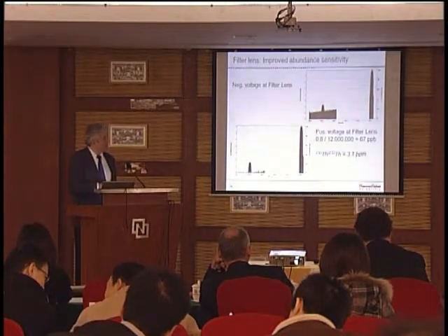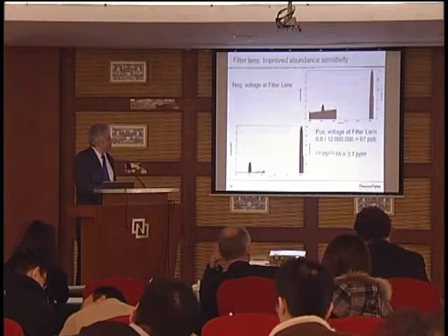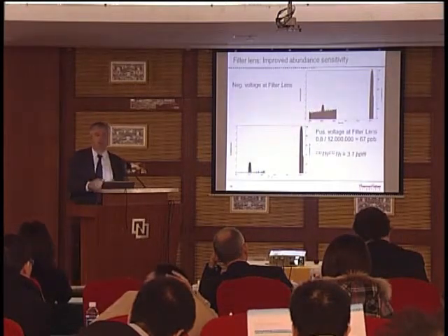But applying now the positive voltage at the filter lens, you clearly see that the abundance effect more or less is solved.